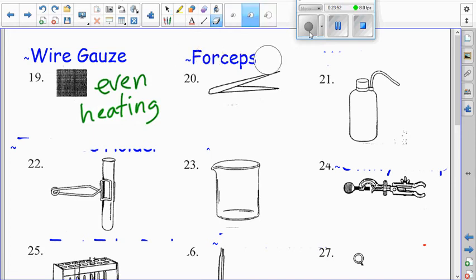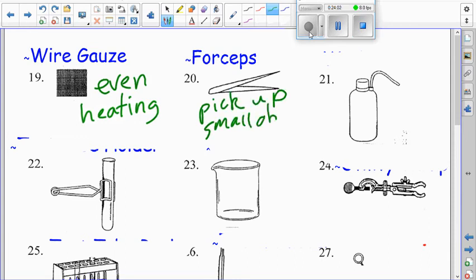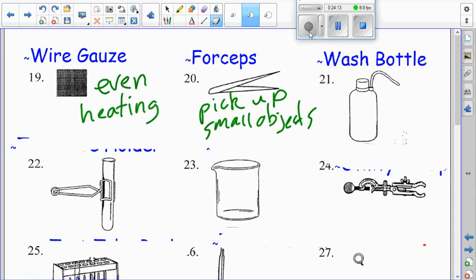The next one, you can also say tweezers. I'll accept tweezers if you say that. They're used to pick up small objects that you probably shouldn't touch, like a hot penny, something like that. This guy right here, you've got a wash bottle. This is just for rinsing things like this. Let's say you've got a little bit of stuff stuck on this beaker. Wash bottle, good for that.